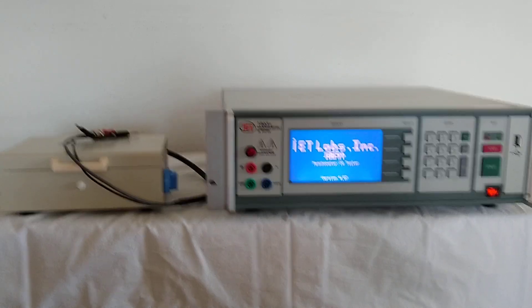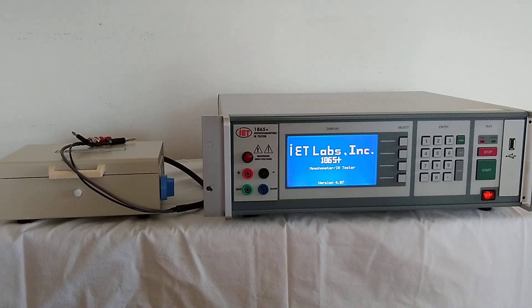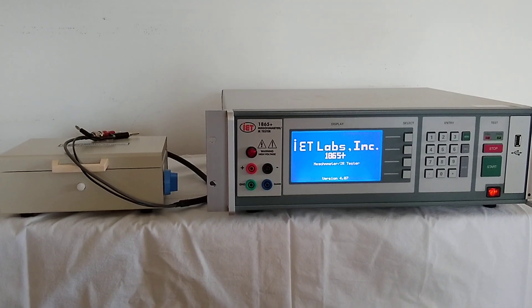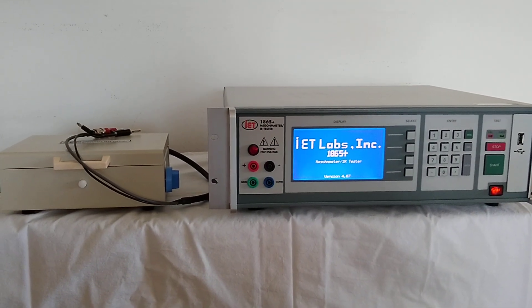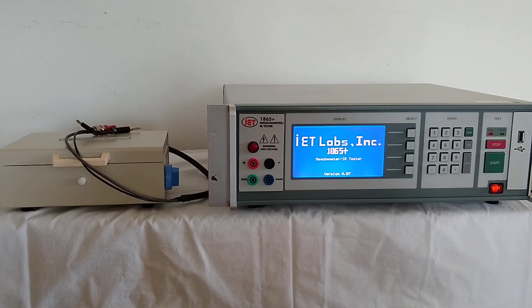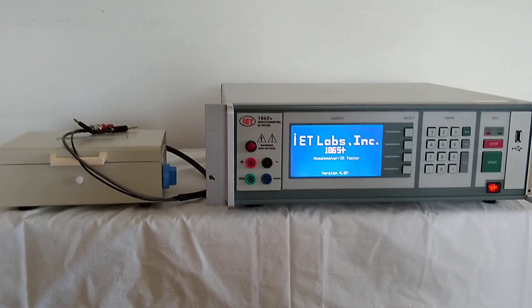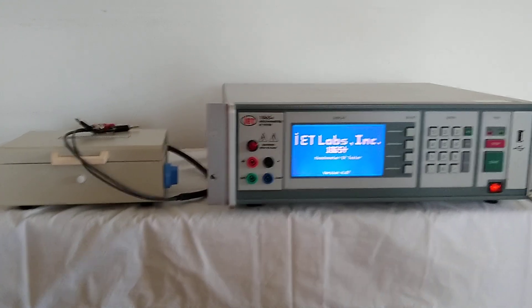Once you've received the two units, please unpack the 1865 Plus, plug it in, turn it on. You should see the basic splash screen.